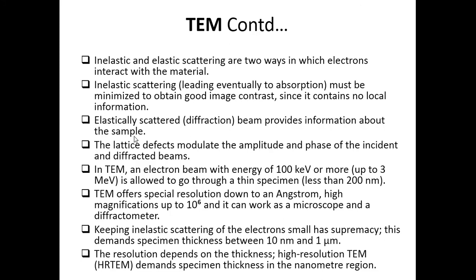Okay. Keeping inelastic scattering of the electrons small is of supreme importance. This demands specimen thickness between 10 nanometer and 1 micrometer. Actually, all this information is required for materials in the nanometric range, that is 10 nanometer up to 1 micrometer. Actually, it is not 1 micrometer, it is about 100 or 200 nanometer, maximum up to 1000 nanometers, that is 1 micrometer. That is that range only. It has been given that particular range.